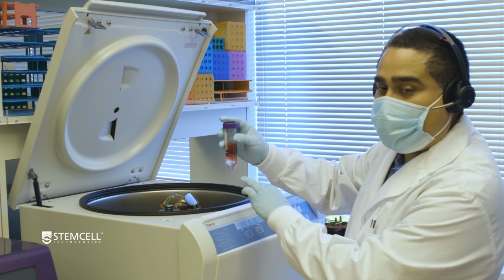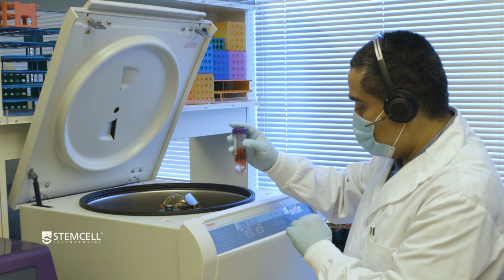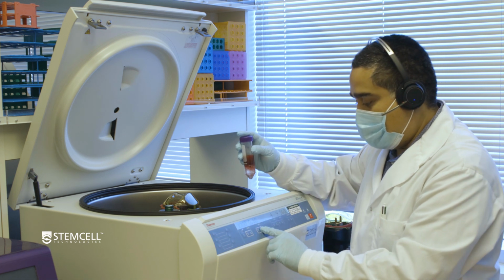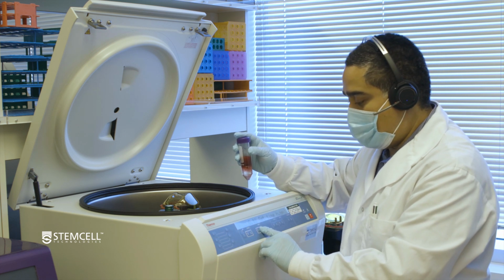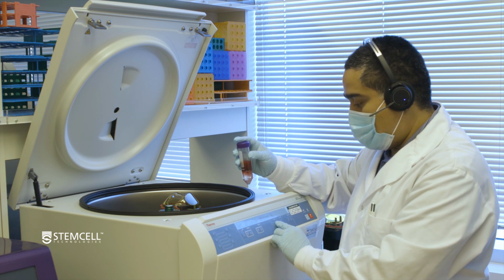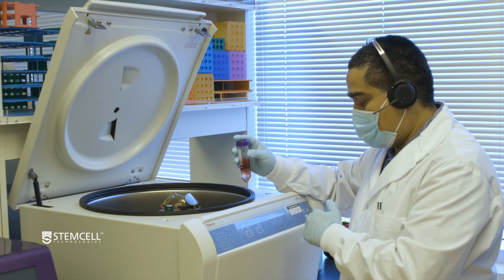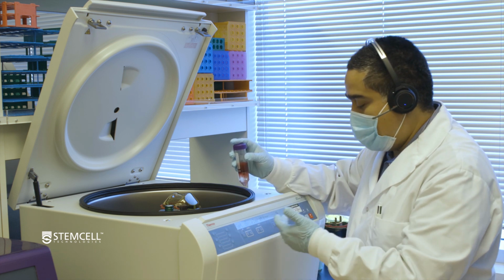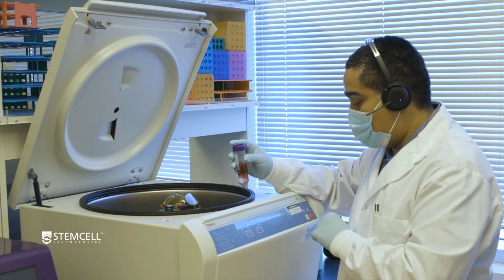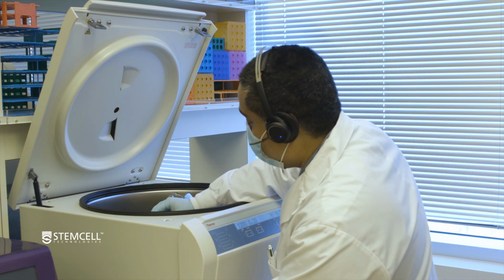And you'll notice that over time, a little bit of red blood cells will start to pellet down. That's perfectly normal. We're going to be spinning at 1200 times G, in this case for 20 minutes, because this is 24-hour-old blood. And we are going to set the acceleration to 9, the deceleration to 9. If you have an instrument such as this one that you can set the deceleration to 8 or 7, you could, if you wanted to, adjust it to that. However, it's perfectly fine just to have it at the top deceleration setting when you're working with SepMate.